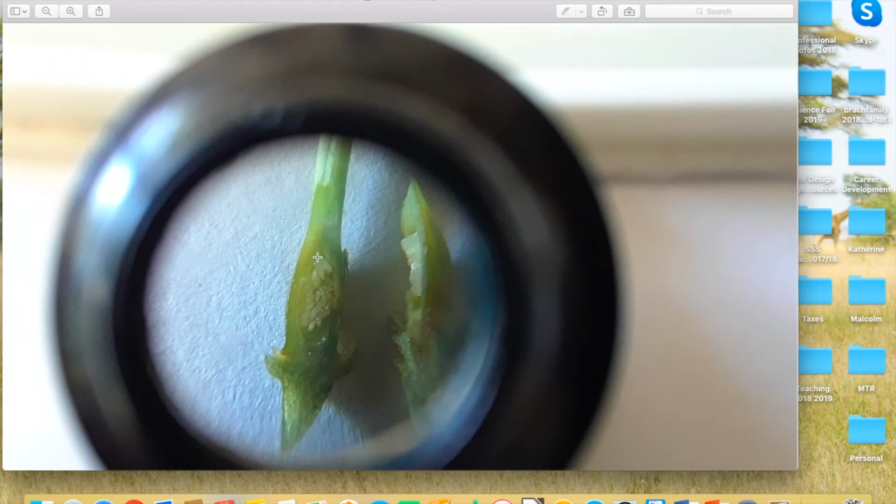Well, what I did here is I did the same thing a bit later, actually. Cut it down the middle, and this is actually a pretty awesome picture. What you can see here is I've bisected the entire pistil, the female part, and when you break it open properly and are careful with it, look at what we have here. All there in the middle, those are the ovules. If they had been fertilized by the male reproductive cells, the male sex cells from the pollen, these little ovules in the ovary would have become seeds for the bog bean.